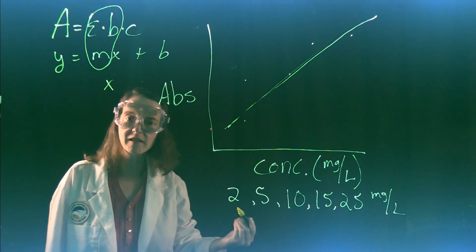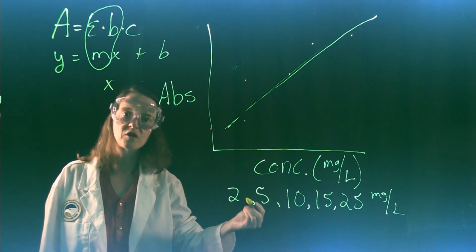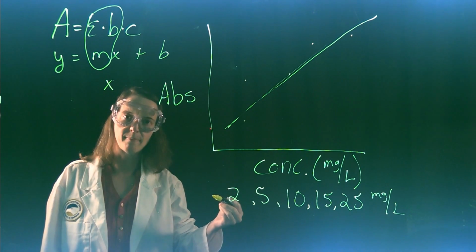You do this for calcium and magnesium, and then you're going to compare your values to the values that are found in the hard water data table included in your lab manual.